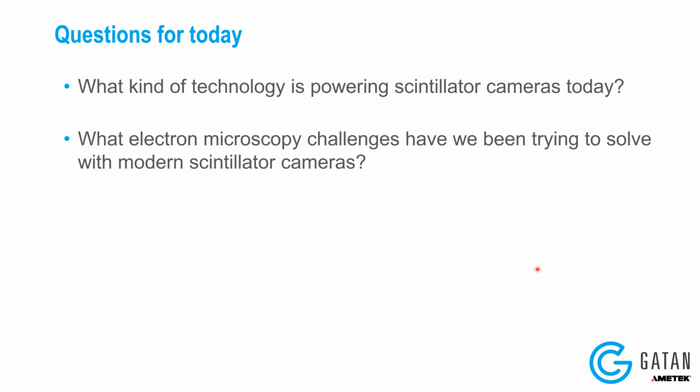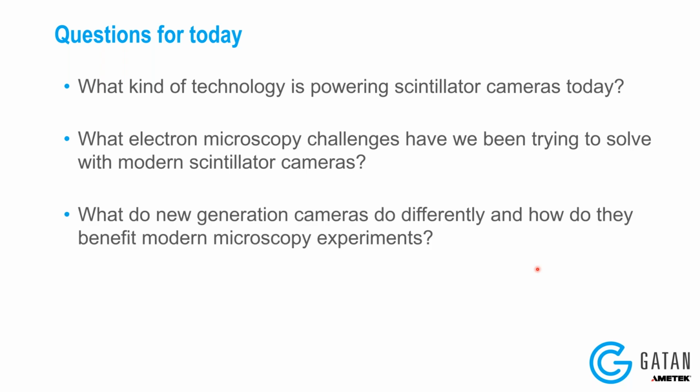Once we understand that, the other thing that's important to understand is what kind of electron microscopy challenges we currently face with modern scintillator cameras, and how the technology powering the cameras and those challenges link up to help define what we're trying to do differently with the development of new hardware features and new software features for these cameras that we use for all sorts of electron microscopy, specifically within the TEM.